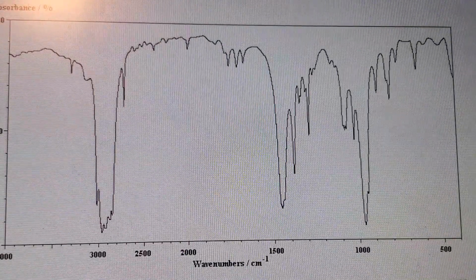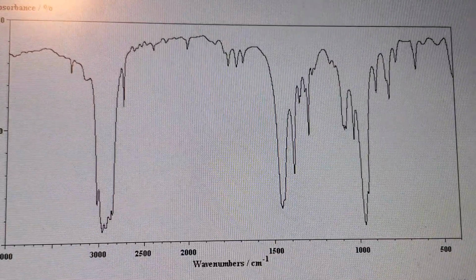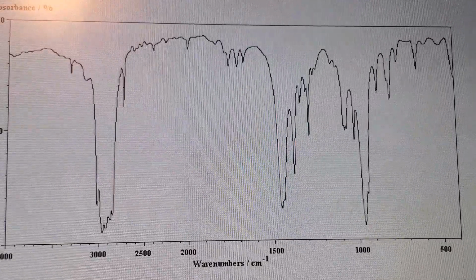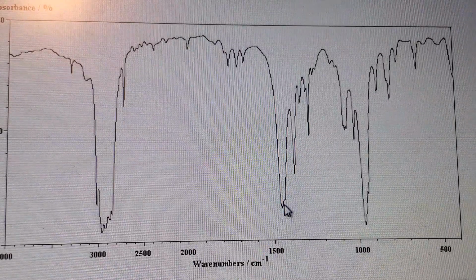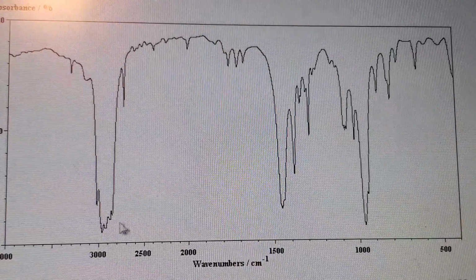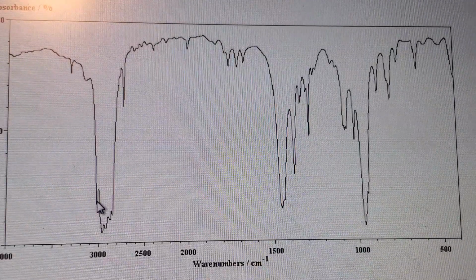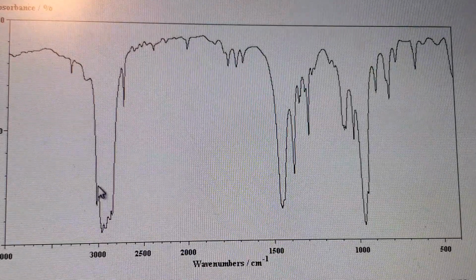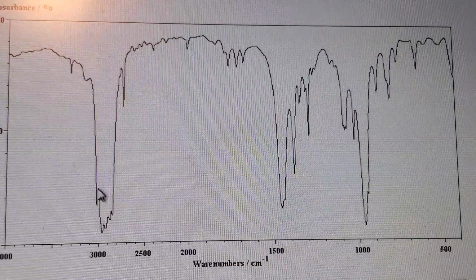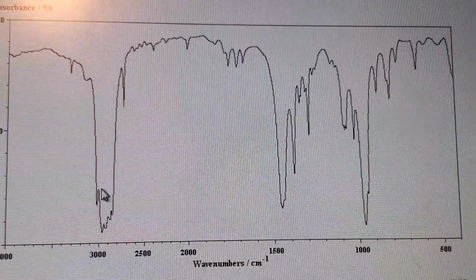And for the intermediate student, not a beginner one, I can tell you that the intensity of this double bond is very unusual. This can be told because, like I said earlier, if you think of the symmetric curve, you can imagine the curve can give you the intensity up to here.